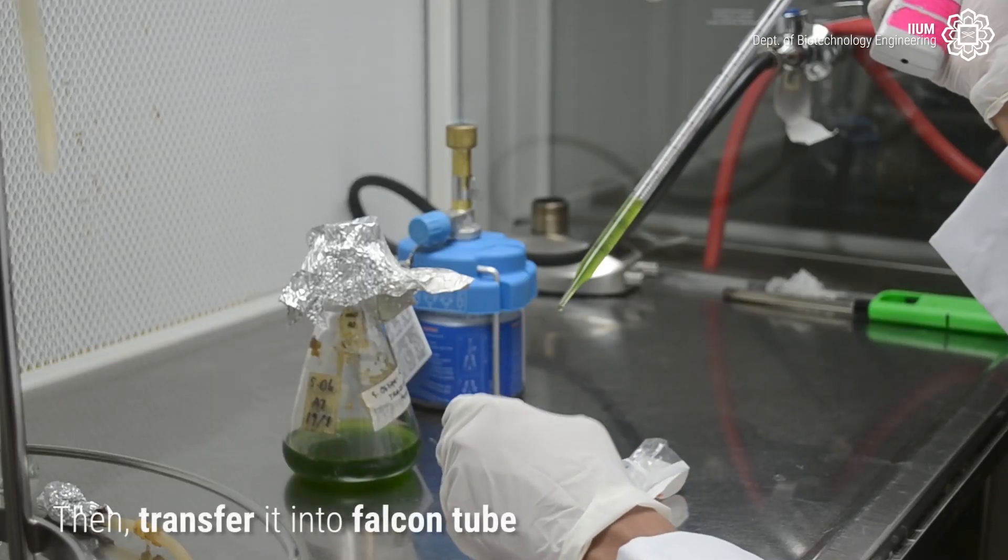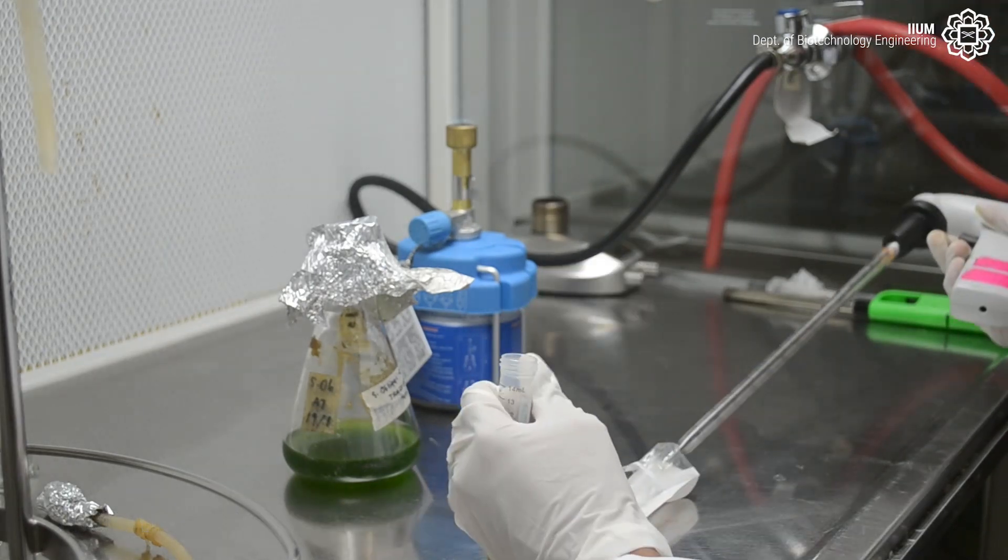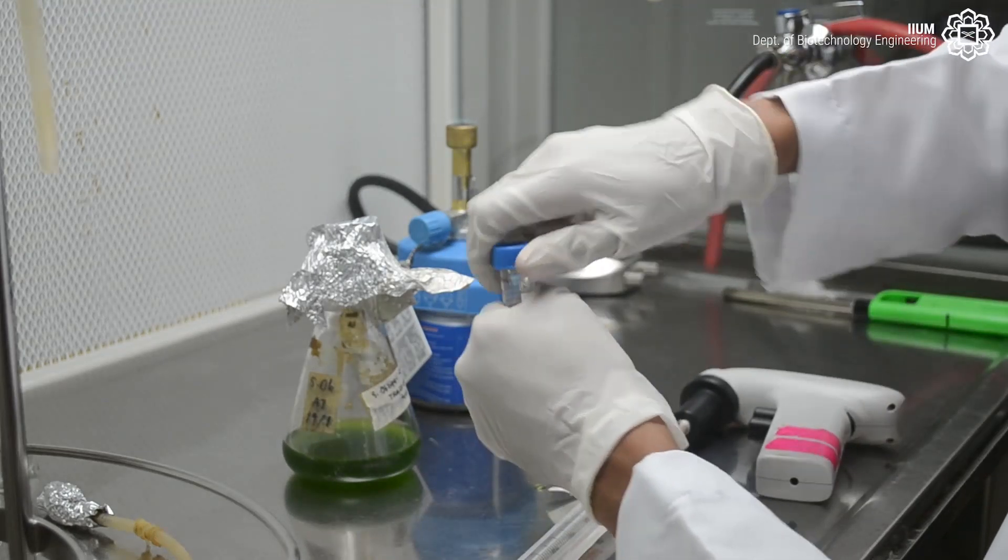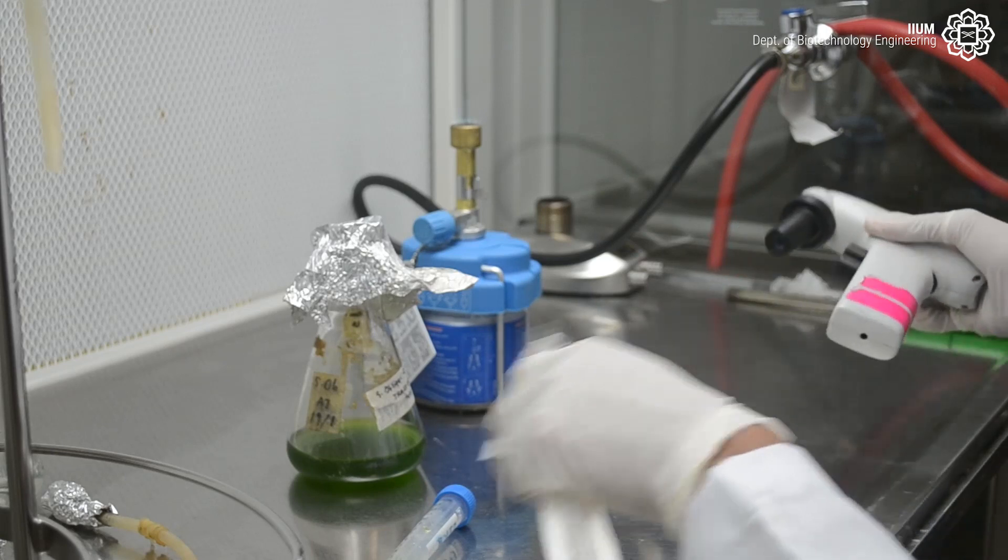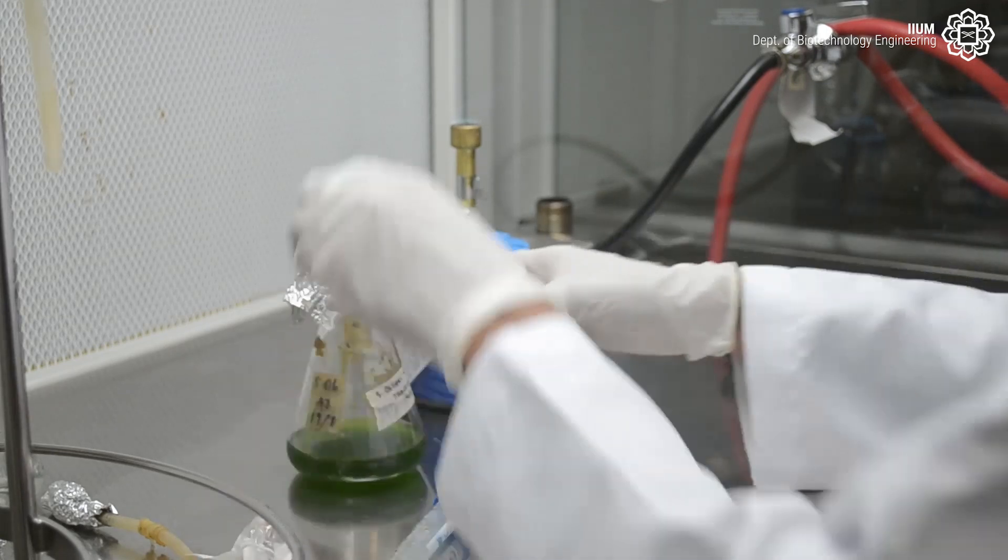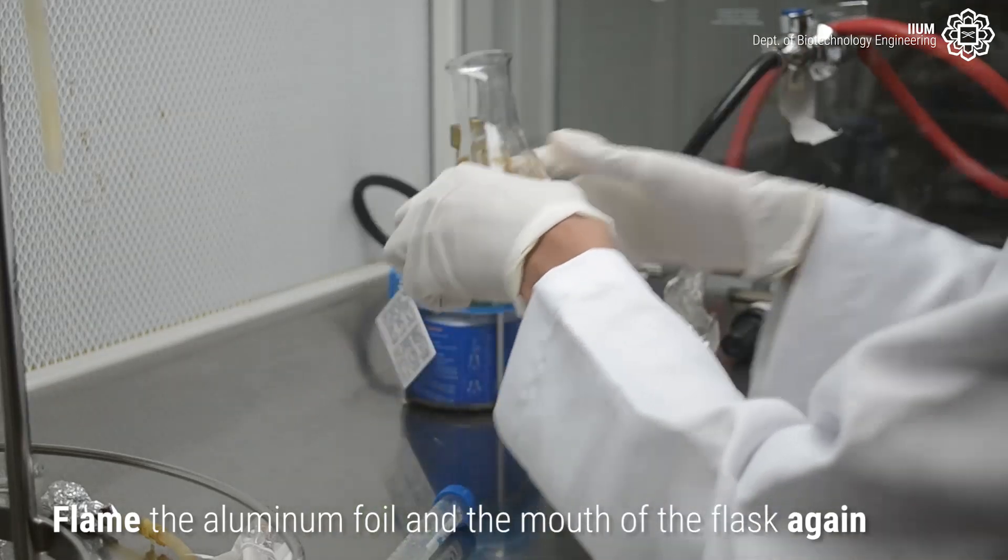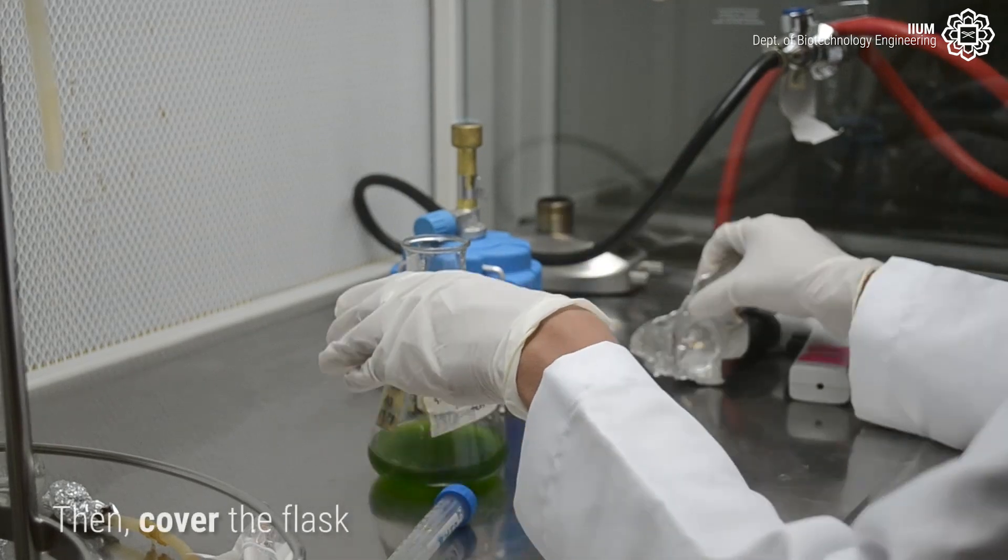Then transfer it into a falcon tube. Flame the aluminum foil and the mouth of the flask again. Then cover the flask.